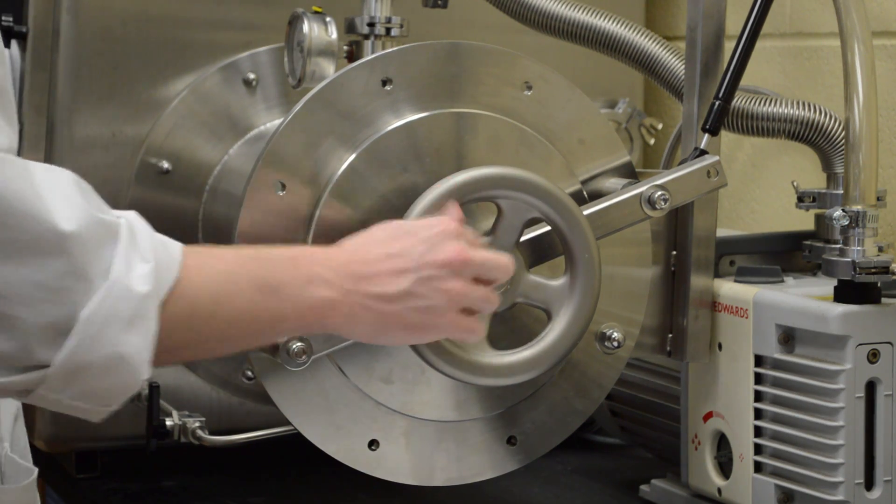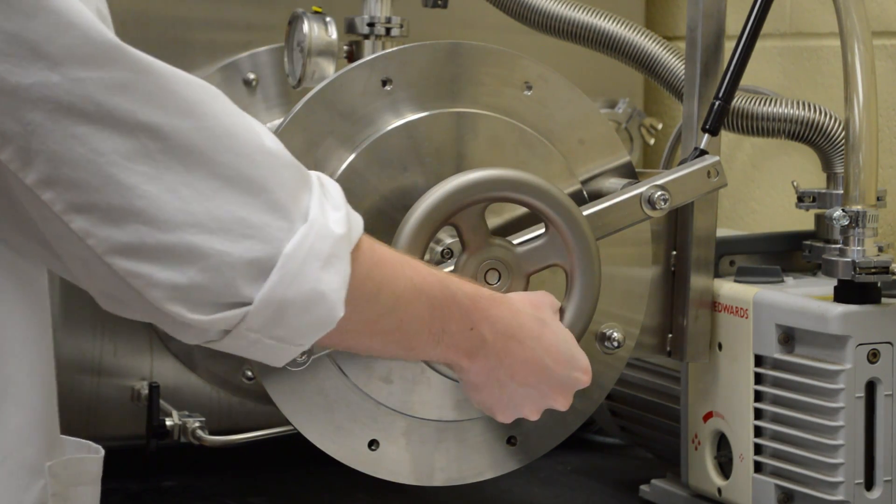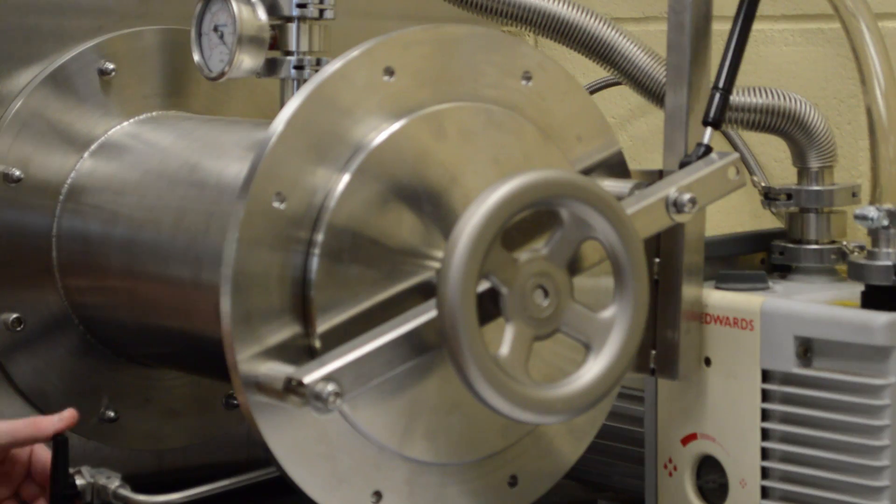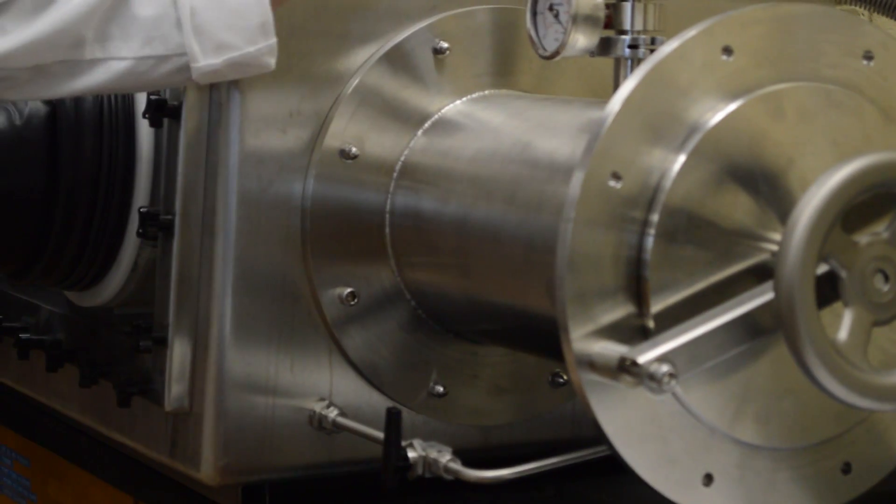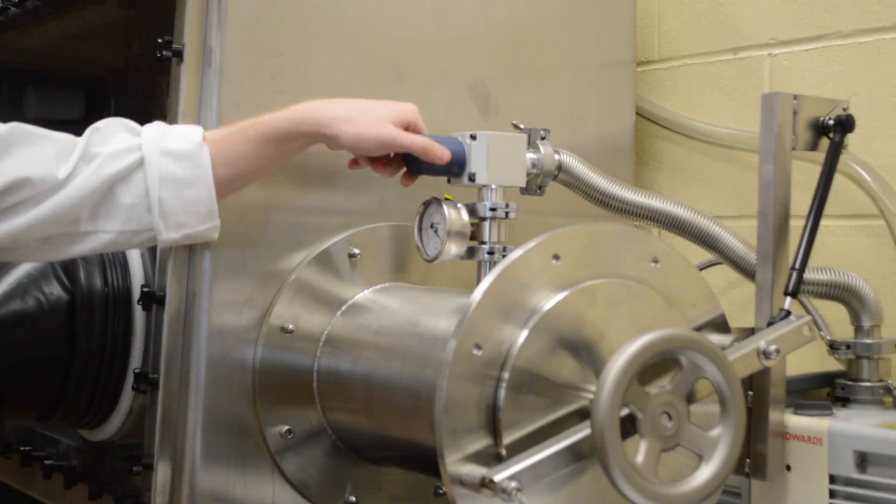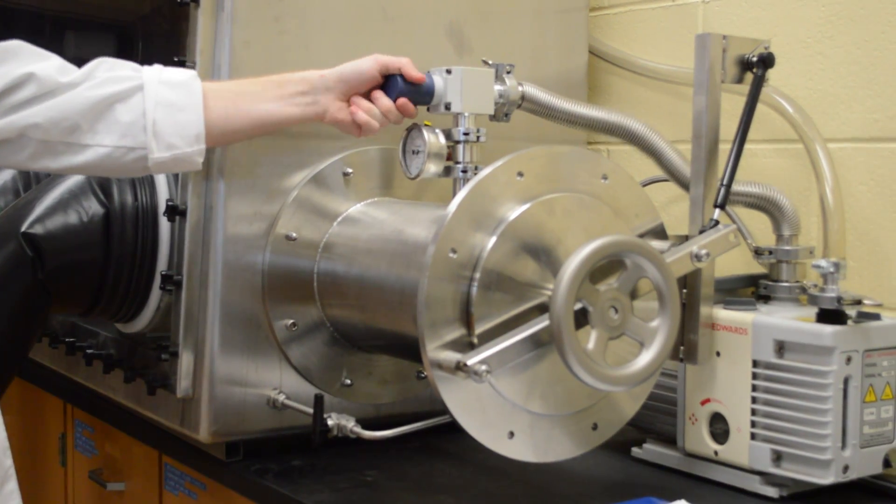When closing these, you want to finger tighten it as much as you can until it won't go any further, and give it another quarter of a turn. Now we need to evacuate this chamber to remove any oxygen inside. So we turn the vacuum on.